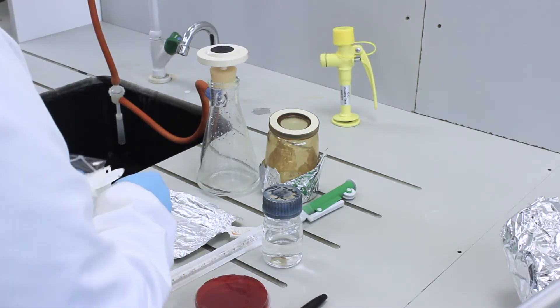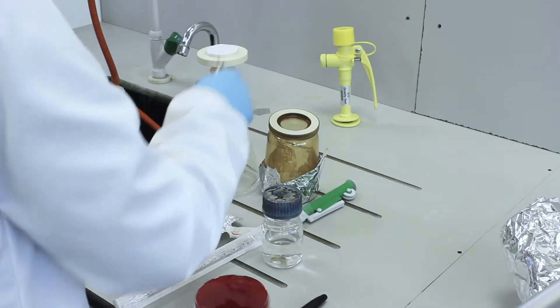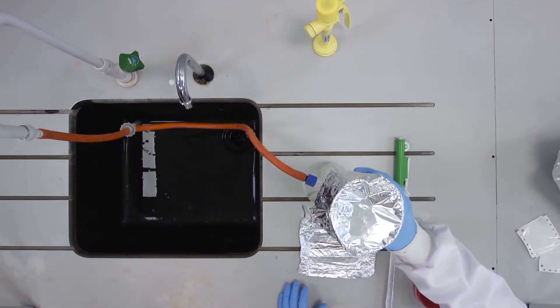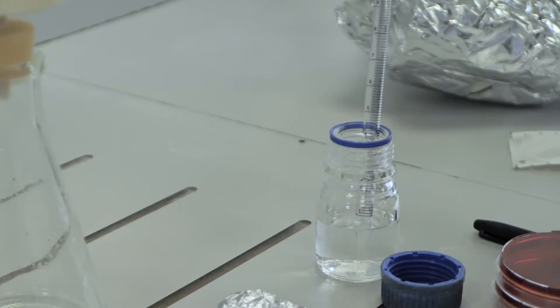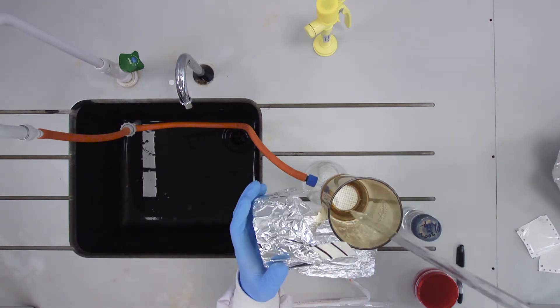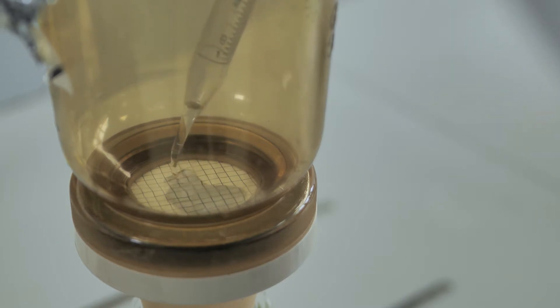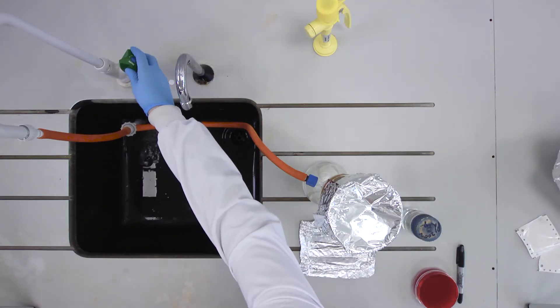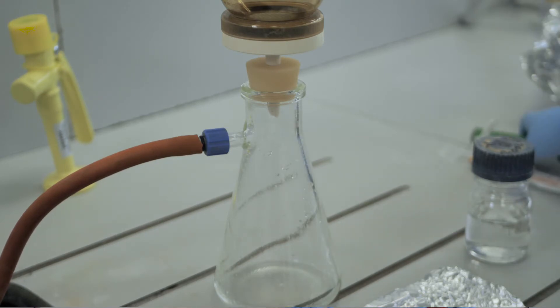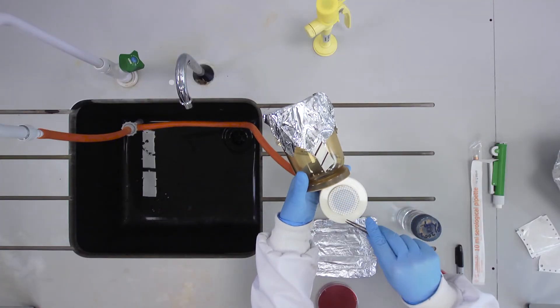Transfer another sterile membrane to the filter unit. This time pipette 1ml of the water sample into the unit using the same pipette as before. Again, draw the liquid through the filter using the Venturi vacuum pump and transfer the membrane to the surface of a membrane laurel sulfate plate.